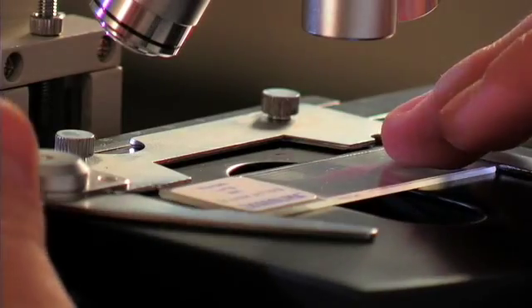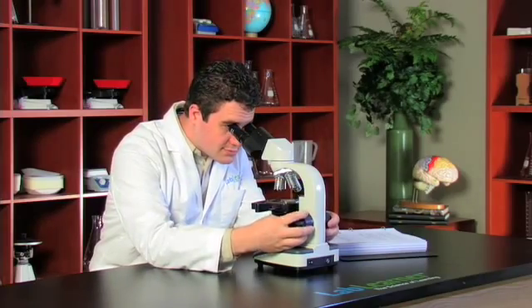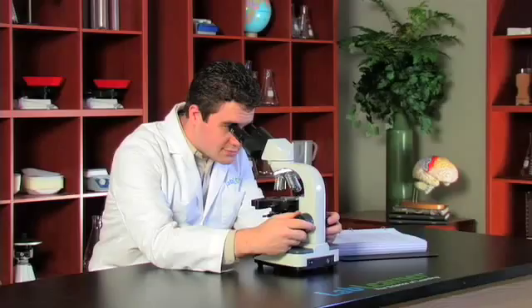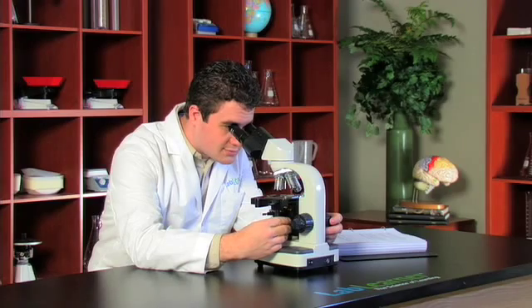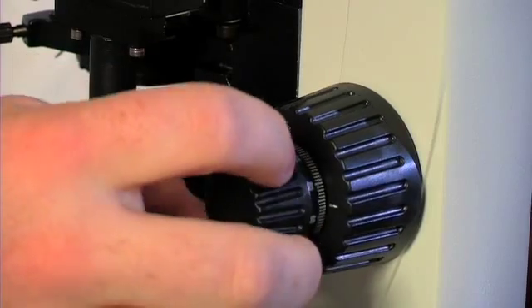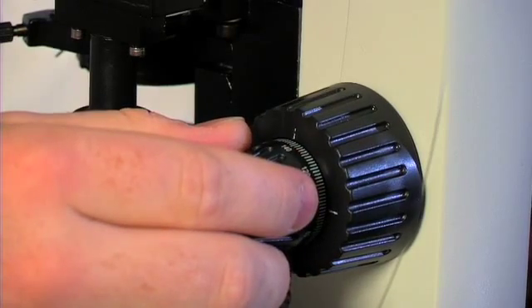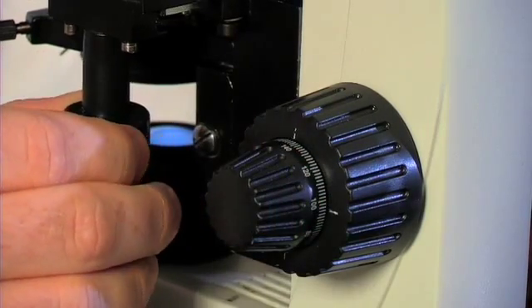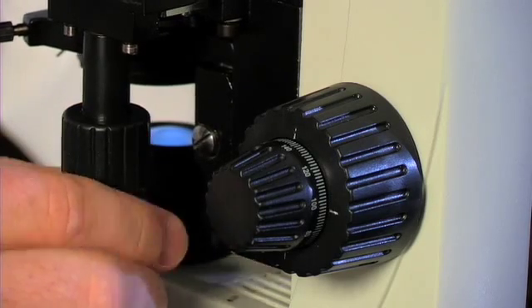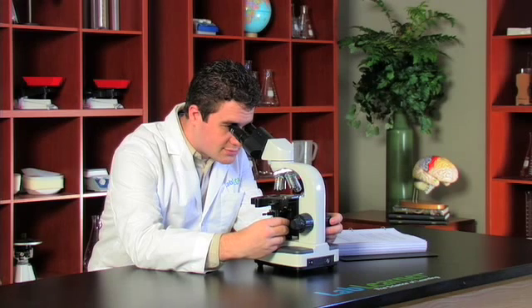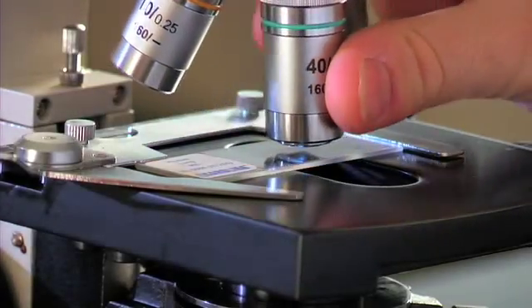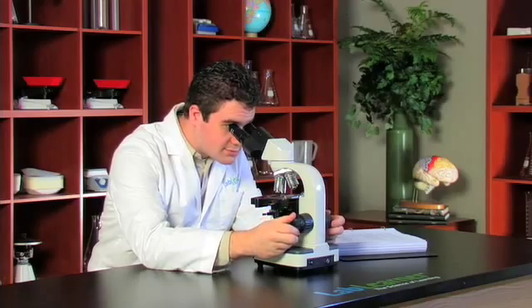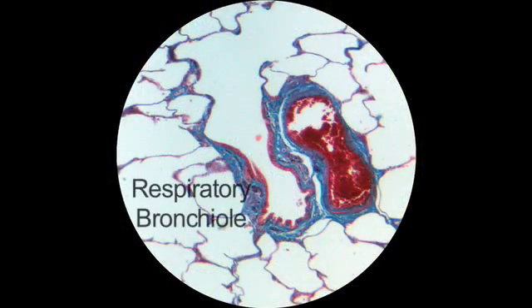The next slide we're going to look at is normal human lung. We do exactly the same thing — put the slide on the stage when it's in its lowest position, use the coarse adjustment to bring it up until it comes into focus, then move to the fine focus. We can use the fine focus as we move up in magnification. The translocation knob lets us move the slide back and forth and up and down. Once we have a well-focused image, we can switch to higher magnifications and again just use the fine focus.